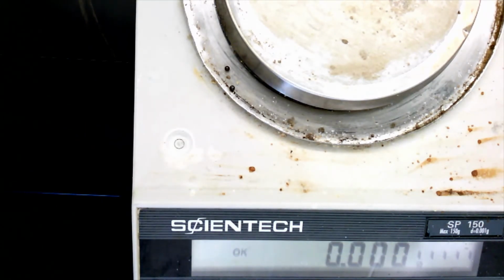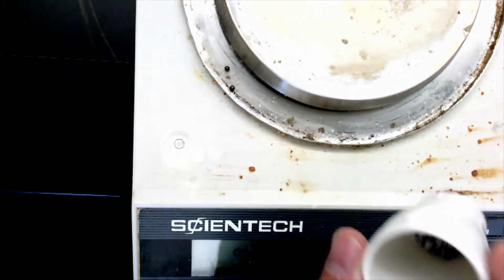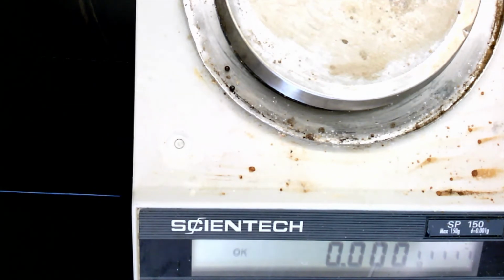With magnesium oxide, what's really happening is we have more solid than we started with. We have a larger mass than we started with, because the magnesium atoms are combining with oxygen atoms. When we started off, we just had magnesium. When we ended, we had magnesium plus oxygen. So we know the mass of magnesium in our product is just whatever was the mass of magnesium we started with. And any additional mass that we've measured our product having at the end is just due to oxygens attaching to the magnesiums.